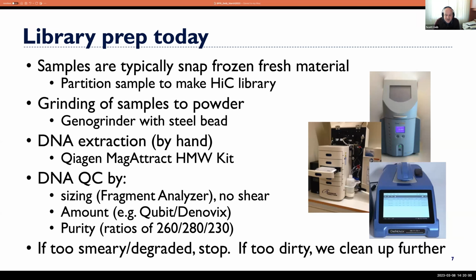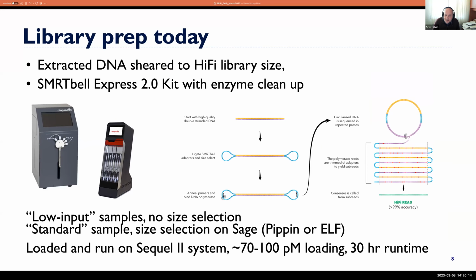So, we usually do a purity ratio first, and if we see we need to do it, we'll do that. Or somebody will try another Ampure or something. With the Ampures, you always get a little sample loss. So yeah. So then we would normally shear the DNA.